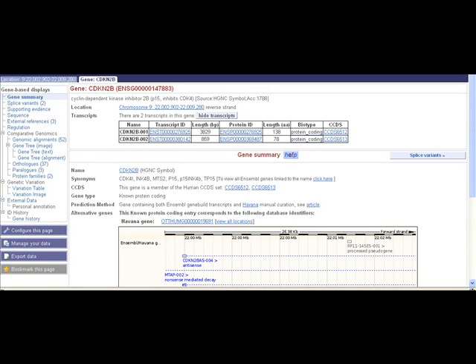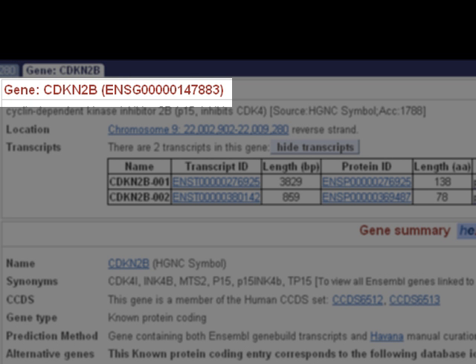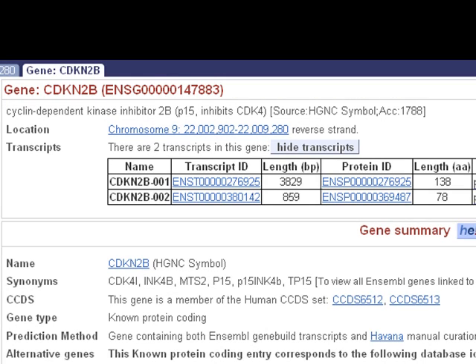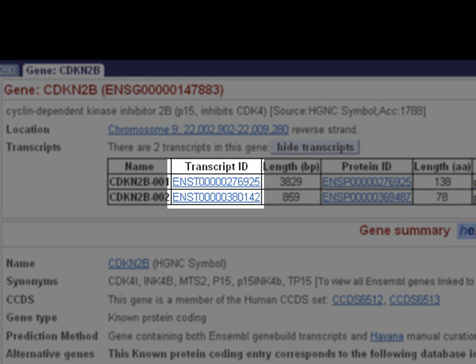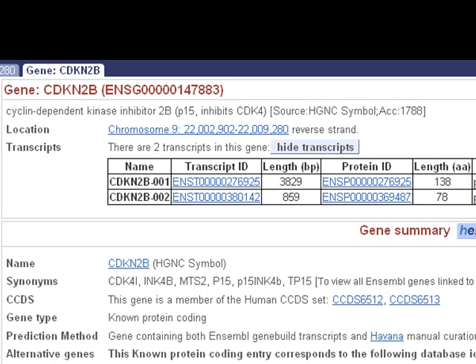The Ensembl gene identifier for this gene is ENSG00000147883. This identifier is stable, meaning even if the gene is updated, the ID should remain the same. Other stable IDs in Ensembl include ENST for transcript, ENSP for protein, ENSE for exon, ENSR for regulatory feature, and ENSFM for protein families.